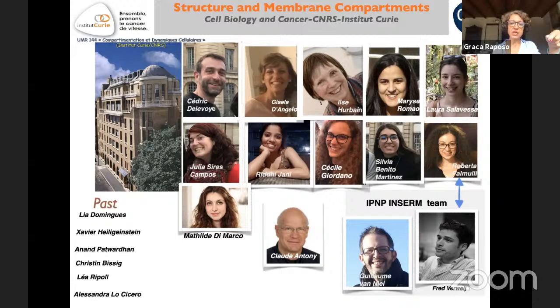When we have proteins inserted into membranes, transmembrane proteins, we fix the samples, we cut the samples, and then we can keep the grids after the picking up for around a week in the fridge.